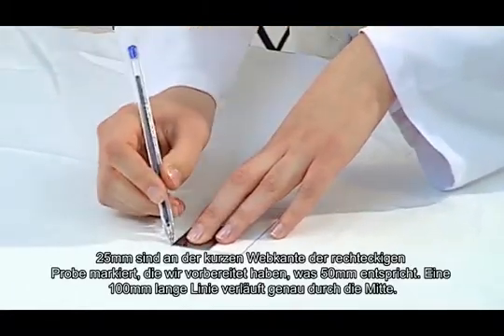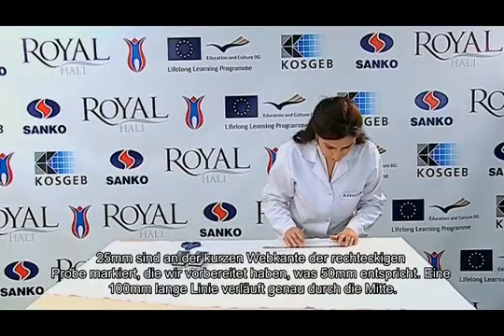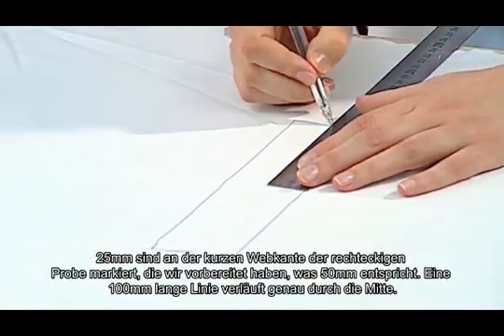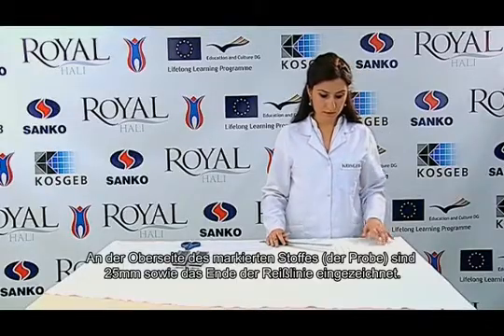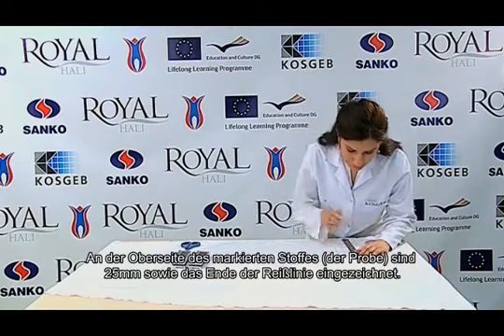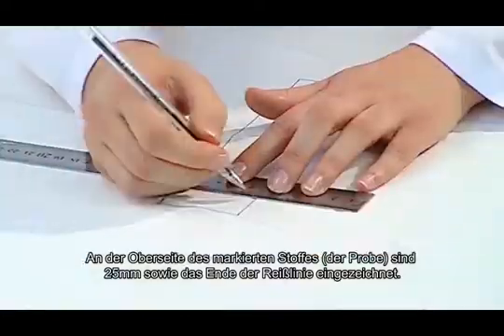25 mm are marked on the short selvage, which is 50 mm of the rectangular sample that we prepared, and a line of 100 mm is drawn just in the middle. 25 mm are marked on the top of the specimen and at the end the tear line is drawn at 25 mm.